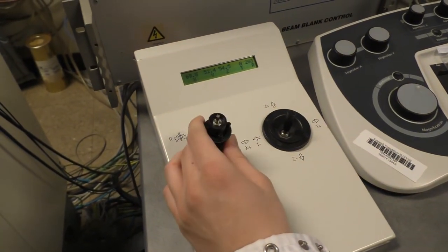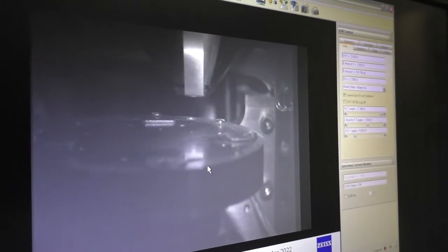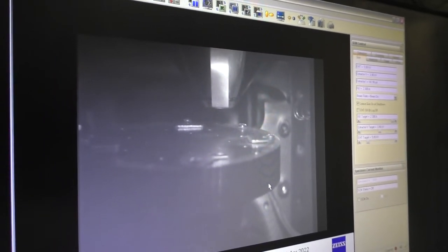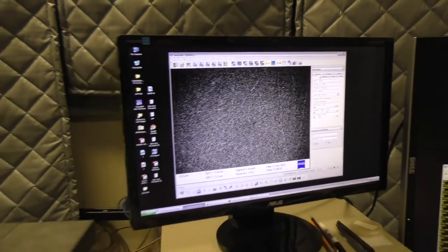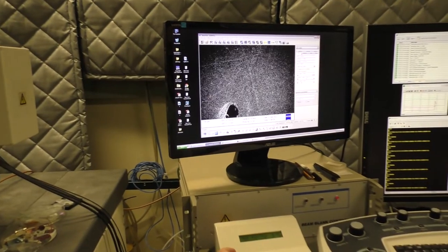Now we switch to the electron detector image and start to see the SEM image of the sample. We can move the motorized stage to see around the device.